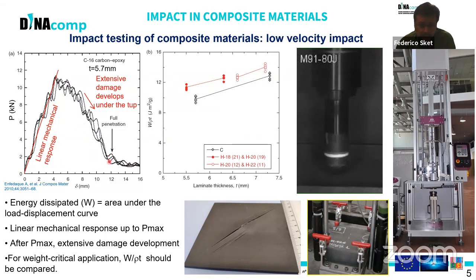At this point here, there is a change in curvature of the curve, which indicates that full penetration has been achieved. And the residual load carried by the tup after this point corresponds to the friction of the lateral tup surface with the laminate.